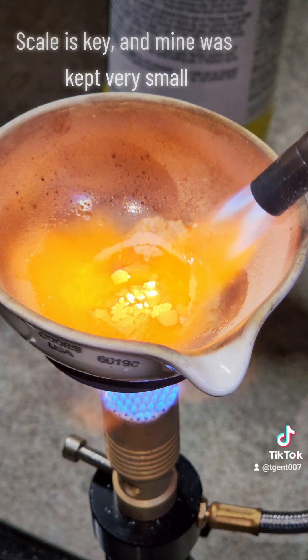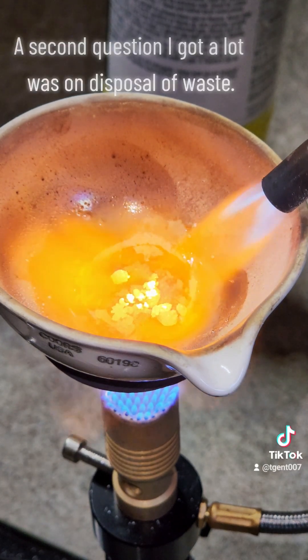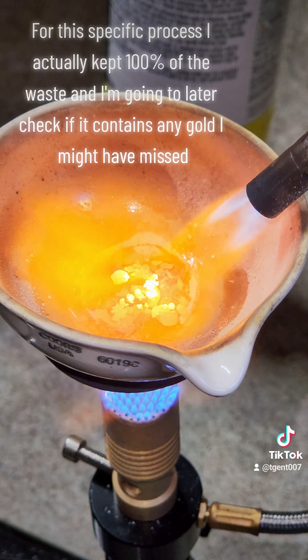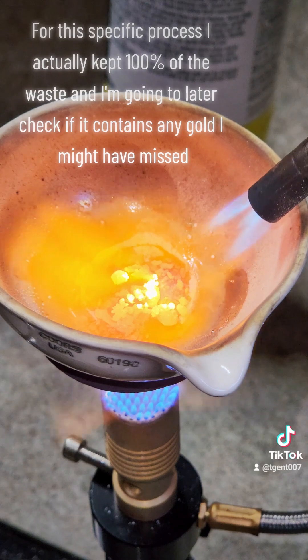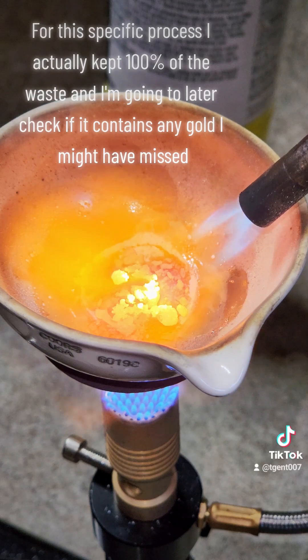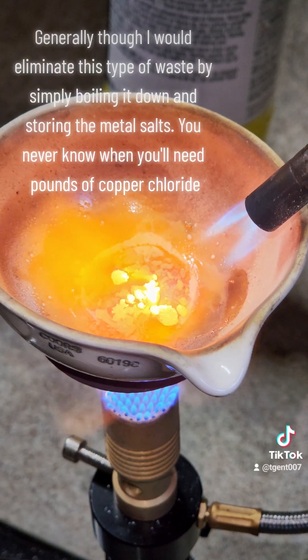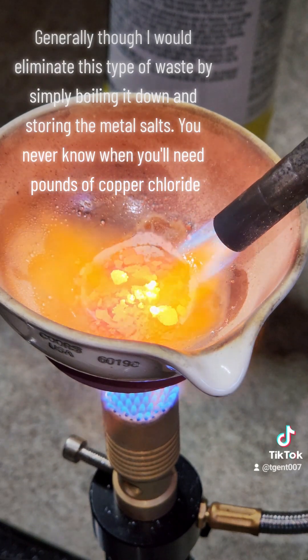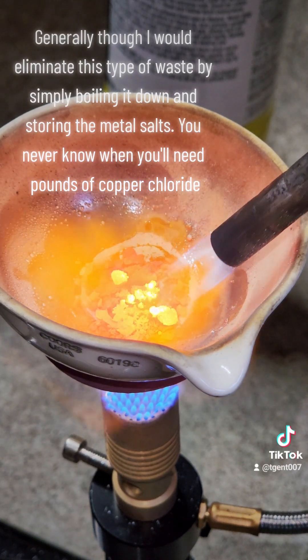A second question I got a lot was on disposal of waste. For this specific process I actually kept 100% of the waste and I'm going to later check if it contains any gold I might have missed. Generally though I would eliminate this type of waste by simply boiling it down and storing the metal salts — you never know when you'll need pounds of copper chloride.